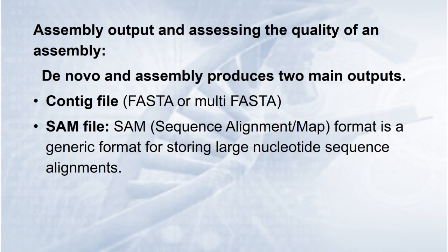So once we have our assembly, well, let's first of all, once we do our assembly, there's a couple of files that become very important. The one that's going to be most important to you is the Contig file. So this is the result of your assembly. You've taken your sequences, you've passed them through your program, which in your case will be called SPADES. And that program will do its best to take all of your FASTQ files and assemble them into contigs.